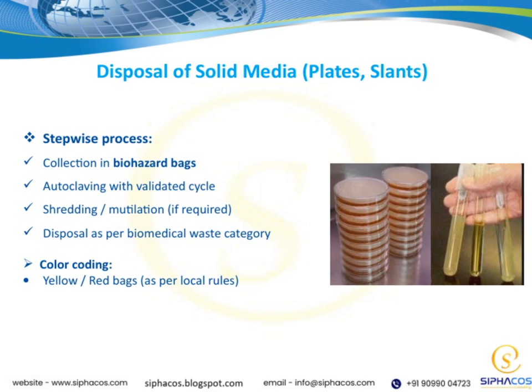After autoclaving, if necessary, the media can be shredded or mutilated to further ensure safety before disposal. Finally, the waste should be disposed of according to the biomedical waste category it falls into, following local regulations.